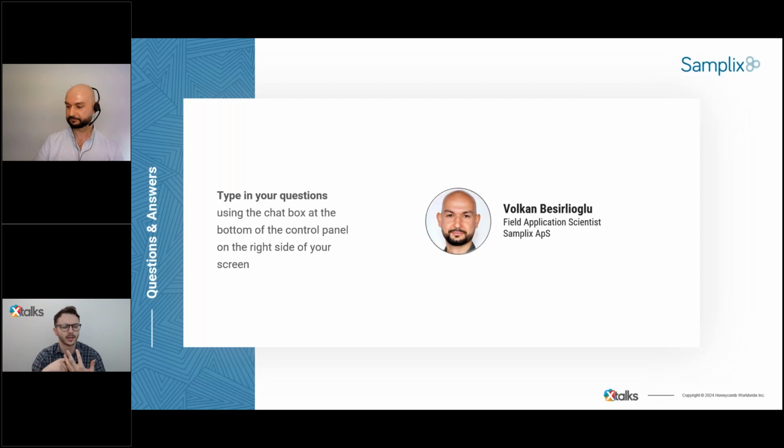Another audience member here is asking about specifically why is it that you use double emulsions in your process? The advantage of double emulsions is that we can integrate them into already existing instruments like cell sorters, and they are quite stable. We also can perform PCRs inside, and yeah.